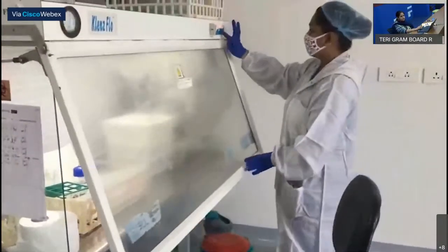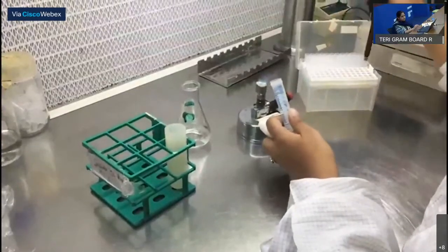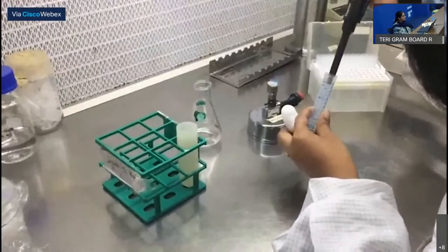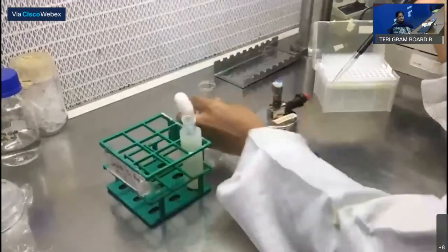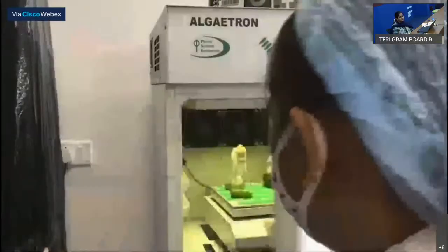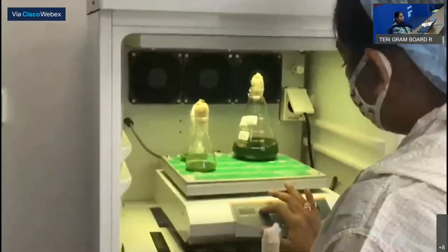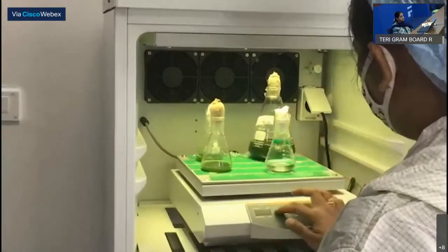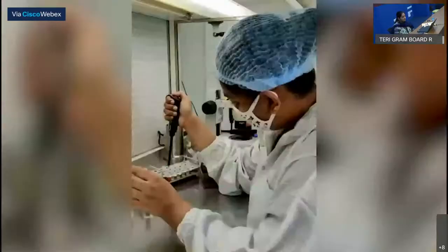The samples collected from diverse habitats, that is freshwater and marine, are harvested at low RPM centrifugation and inoculated into the respective media, that is BG-11 for freshwater and F/2 for marine. The cultures are kept under optimum growth conditions of 120 micro-Einstein per meter square per second of light intensity, 25 degrees Celsius temperature, 16:8 hours photoperiod, in shaking.